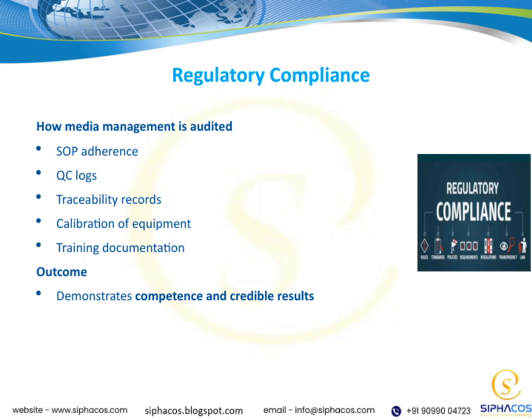Calibration of equipment is another critical element. By regularly calibrating our tools, we make sure measurements remain accurate over time. Additionally, comprehensive training documentation demonstrates that our team is well-trained and competent. All of these components come together to produce credible results and demonstrate our commitment to competence. This thorough approach not only keeps us compliant, but also reinforces the integrity of our work, an essential part of maintaining trust in our processes and outcomes.